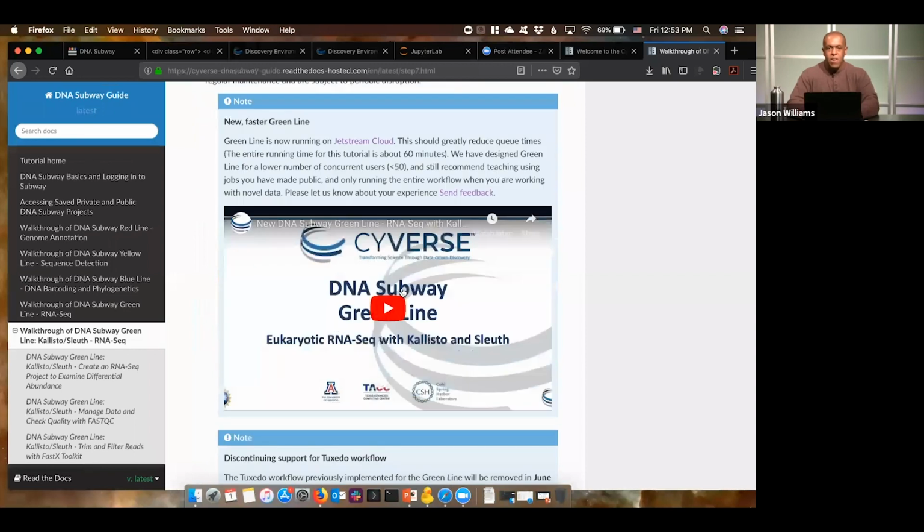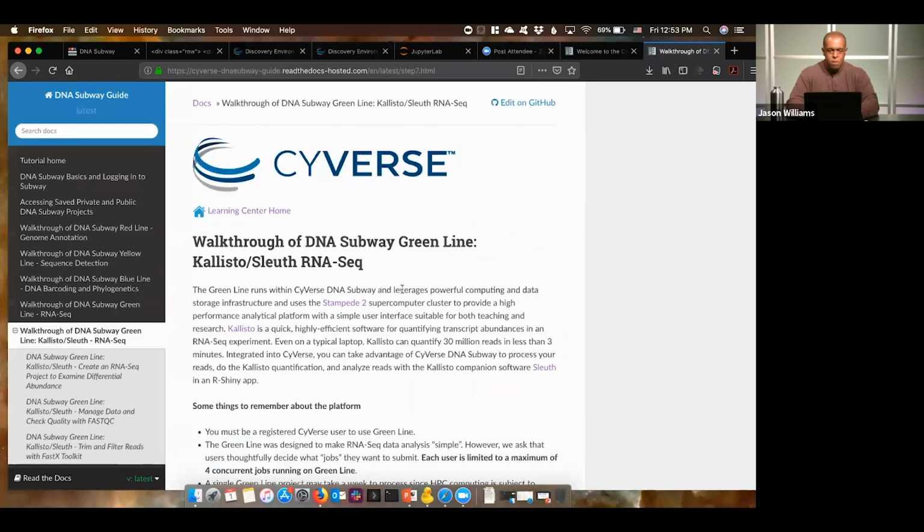There's also a brand new 5-minute video that walks you through DNA Subway Green Line, just the highlights. It's less than 5 minutes. It's a quick recap to orient you through everything that you've seen there. So take advantage of those learning materials.